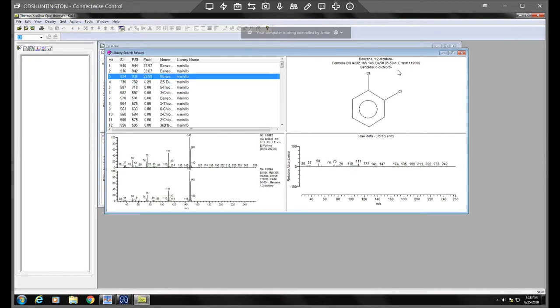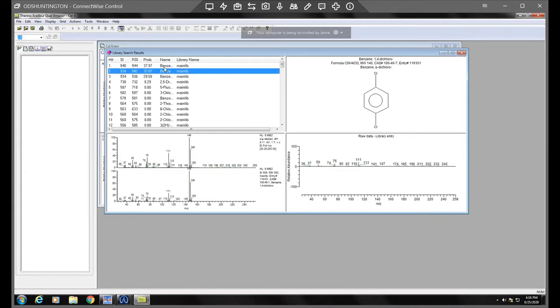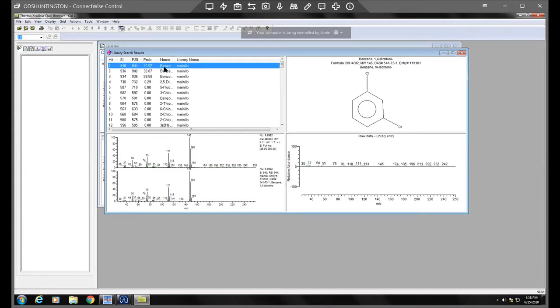I'm going to go with the top one just because I would trust that that's the most accurate, but we can verify that this one.